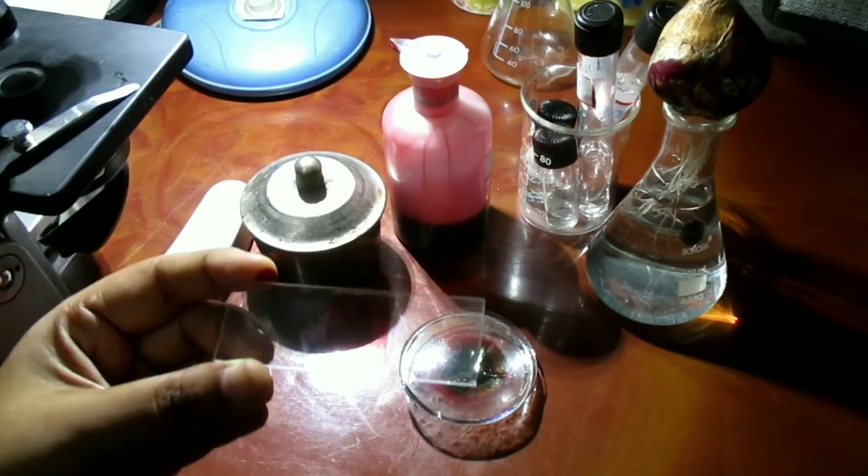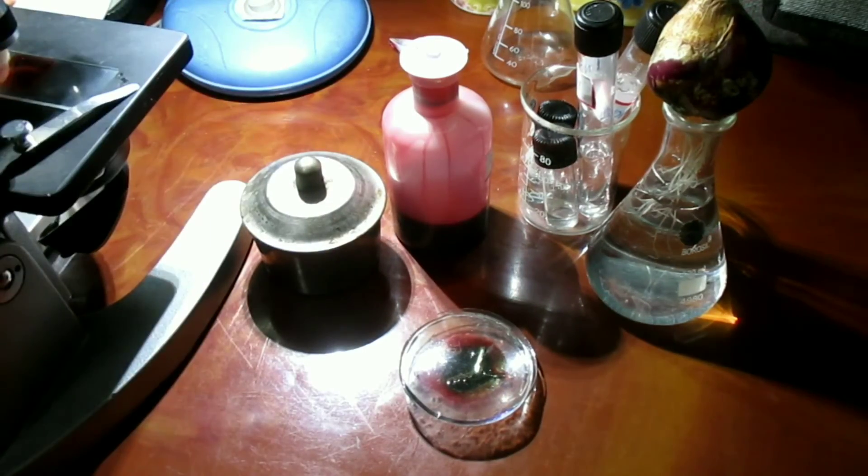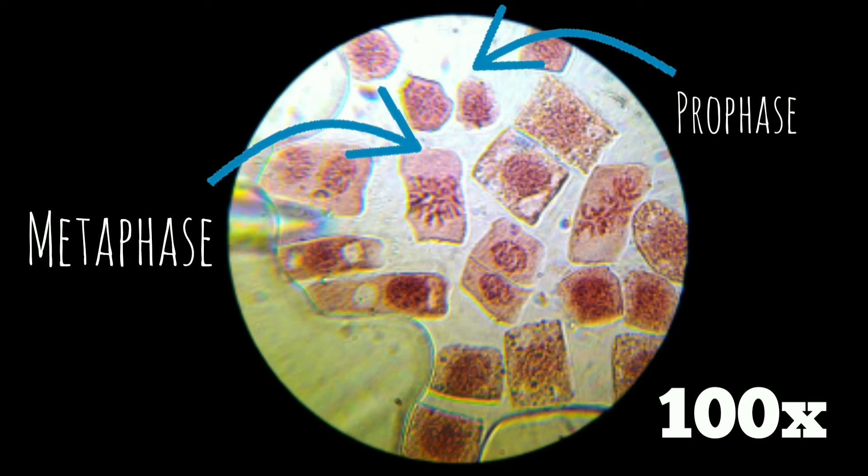Now the slide is ready for observation under 40X and 100X magnification respectively. Here are the stages we can identify: Prophase, Metaphase, Anaphase, and Telophase.